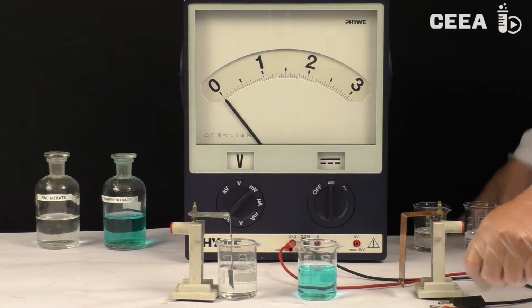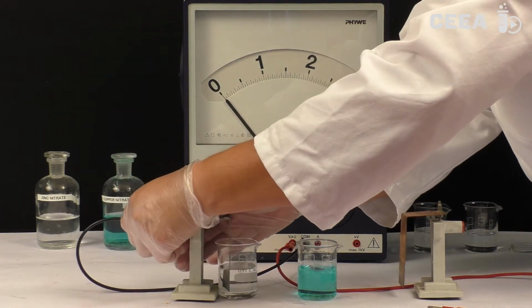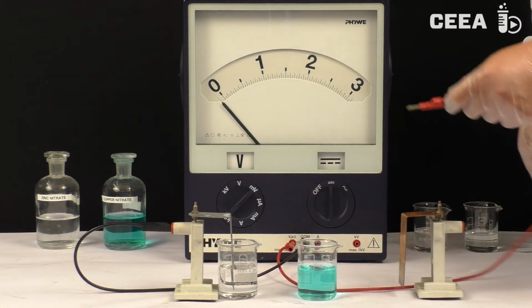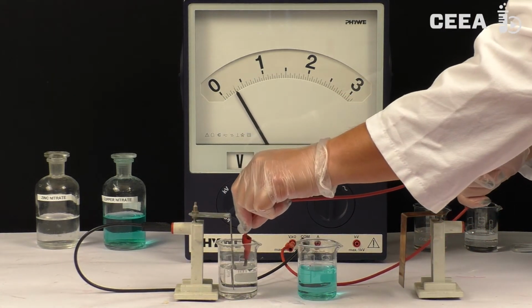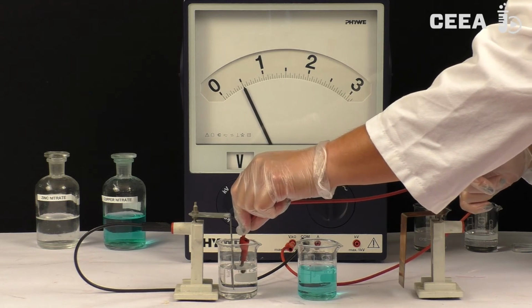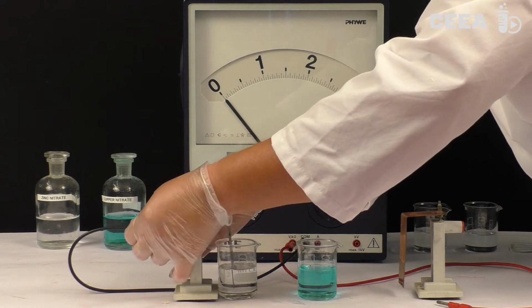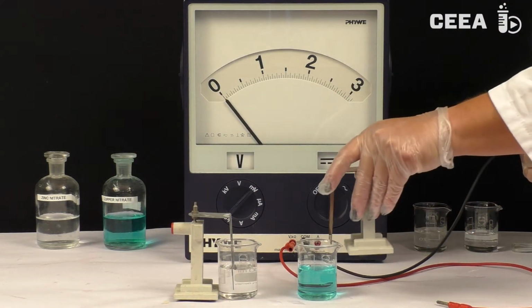As in the first set of experiments, we place a zinc plate in the zinc solution and the copper plate in the copper 2 solution. We measure the potential differences between each plate and its solution. Here again, the zinc plate appears to be negative, confirming our explanation that zinc prefers the ionic state.